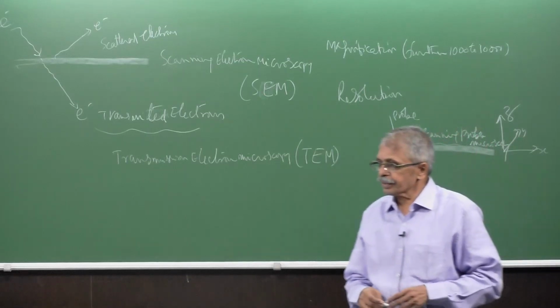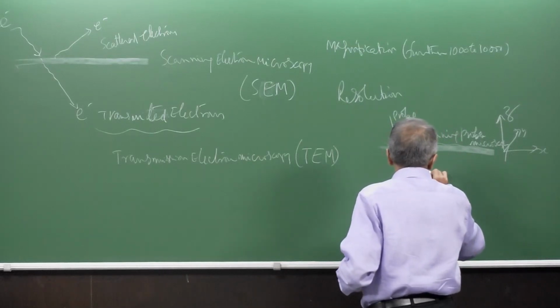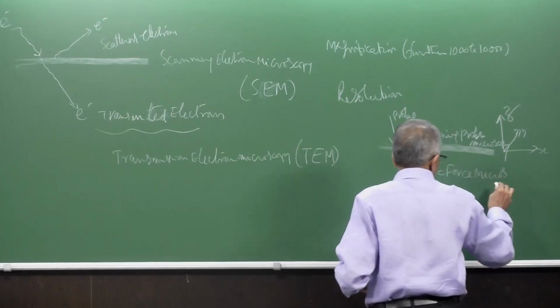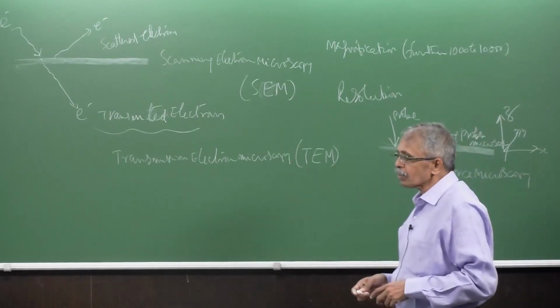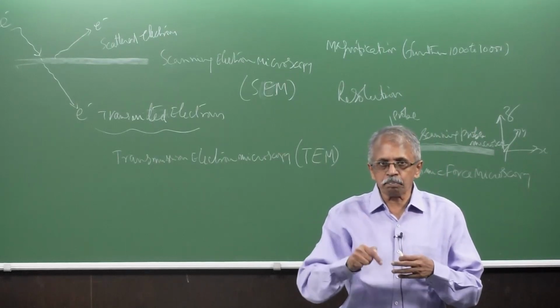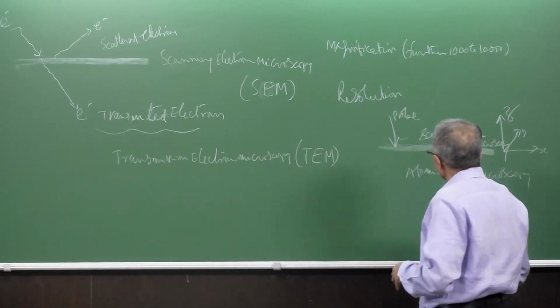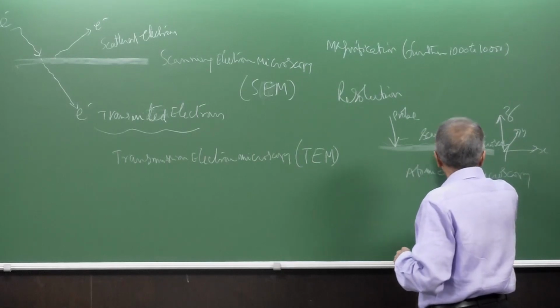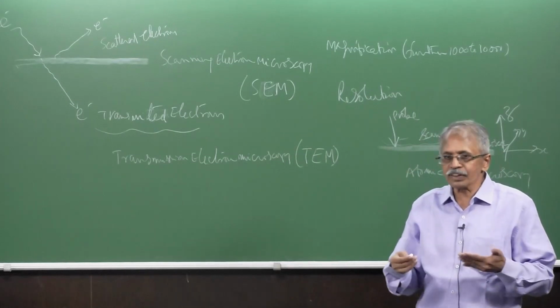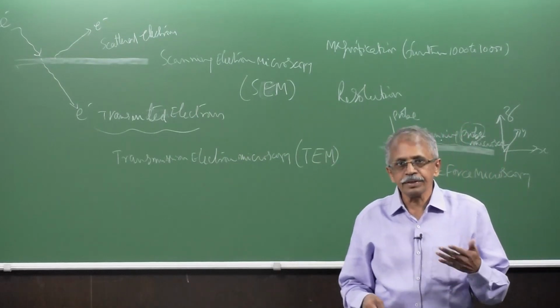So this is where the thing is. What we see is that atomic force microscopy is one of them. This will not use any energized particle. It will have only a touching nose, and that touching tip will keep touching the whole surface and bringing the information. That is why it's called scanning probe microscopy. It is a probe, so it probes certain information, some forces, and it scans and gives an image. Microscopy means an image.